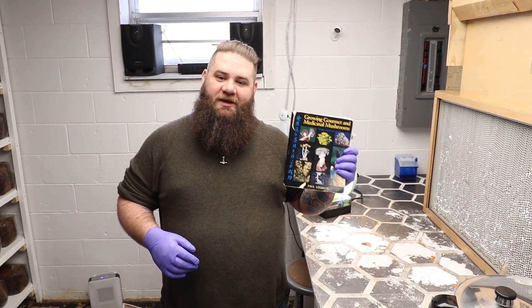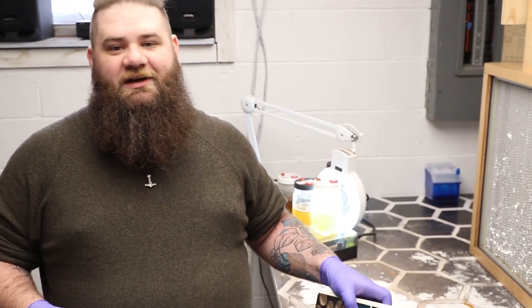Paul Stamets in his book Growing Gourmet and Medicinal Mushrooms talks about the importance of Grain Masters and their ability to take mycelium from agar or liquid culture and expand that to a hundred, a thousand, or even sometimes ten thousand times its own mycelial mass. Basically, that's just a fancy word for making a whole lot more from what little bit you're starting with.